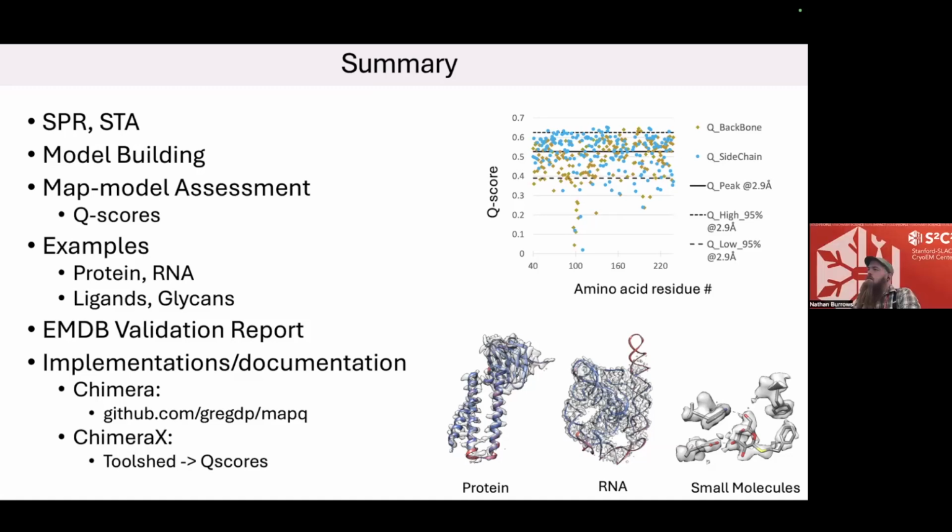Okay, let's see here. For a large molecule with low and high resolution regions, focused classification and refinement give good maps for model building. Would it be good practice to use a composite map of the focused refinements to calculate Q-scores? How do you handle this?